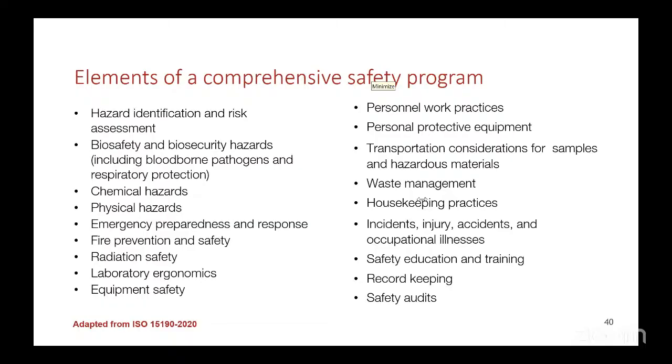What are the other 5S? Shine, yes. Standardize, sustain. Yeah, that is the 5S. Clap for yourself. So we have sort, set in order, shine, standardize, and sustain.